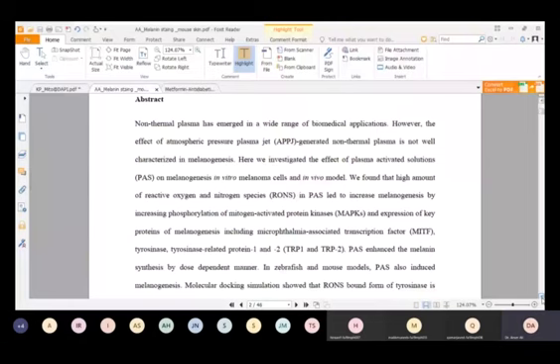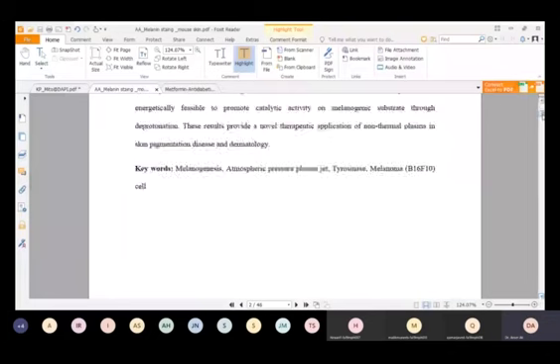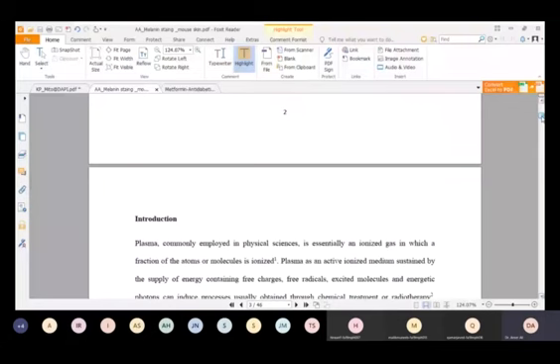During their work, they found that after plasma treatment, the melanin content increased in the cell. They wanted to see if this is possible in a mouse model as well. For this, they treated the mouse tail with plasma activated solution and stained it with Fontana-Masson staining, which is specialized for melanin staining. So how did they proceed for this staining? Let's look at the material and method section.